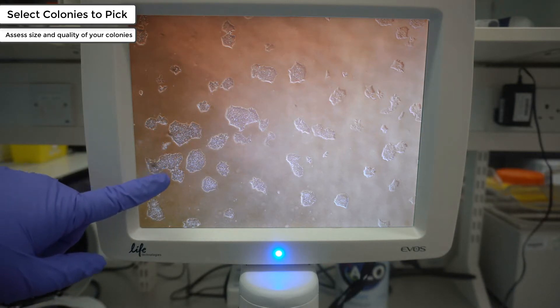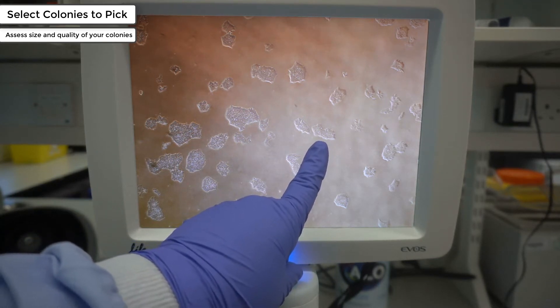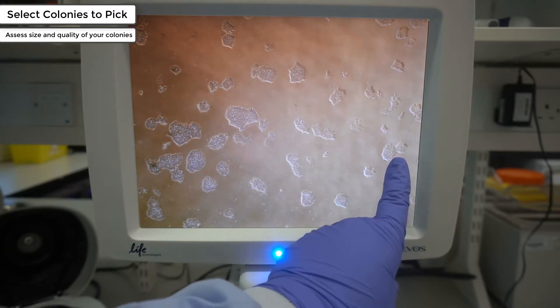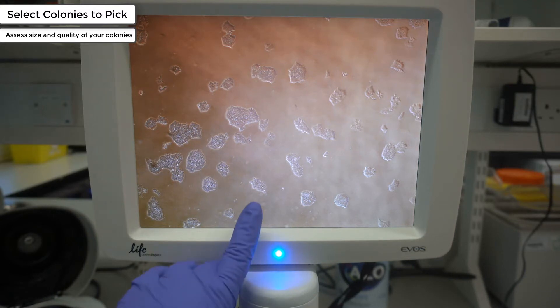There are also colonies that are starting to merge into one another. This will make it difficult to colony pick if you're working clonally due to the proximity between the colonies. Here are some more examples of partially reprogrammed cells. When selecting the most appropriate colonies to pick, colonies that have well-defined and round edges are ideal. It is recommended to avoid picking colonies that have a spiky or undefined edge, due to the higher likelihood of these colonies differentiating out after colony picking.